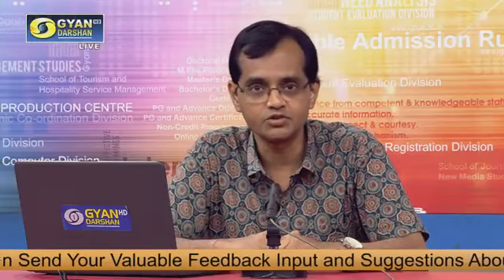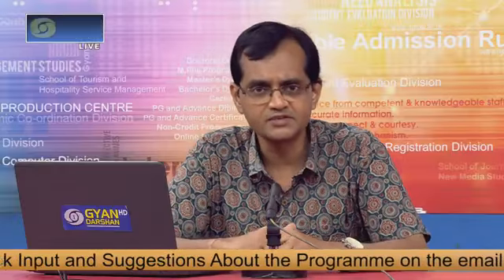Or let's say you are doing some genetic engineering. You are cloning a particular gene. Okay? And then you are integrating the gene within the genome of a plant or an animal. So you need to know whether the gene has been incorporated within the genome. So for that, what you have to do? You have to again isolate the genomic DNA. For all these purposes, there are many other reasons, but these are some of the prime reasons for which you have to know how to isolate the genomic DNA.